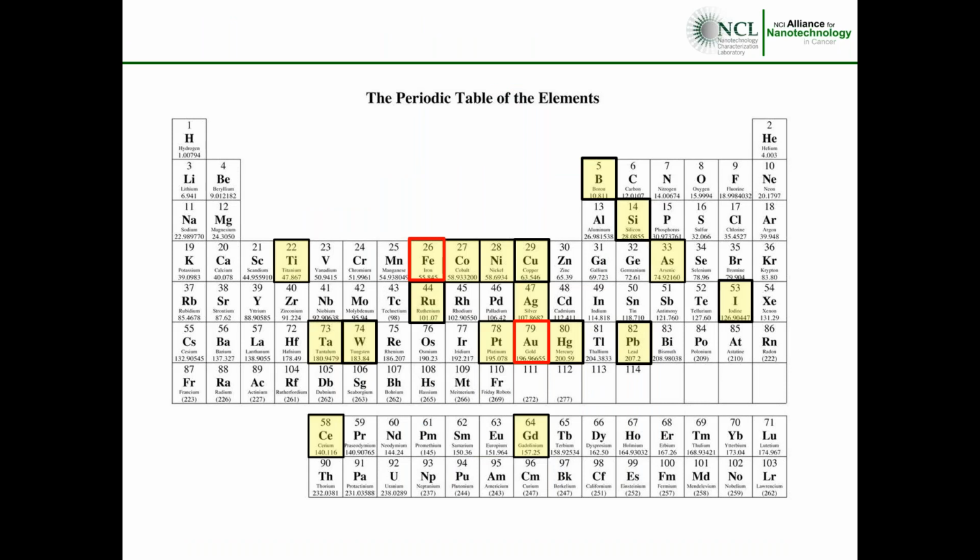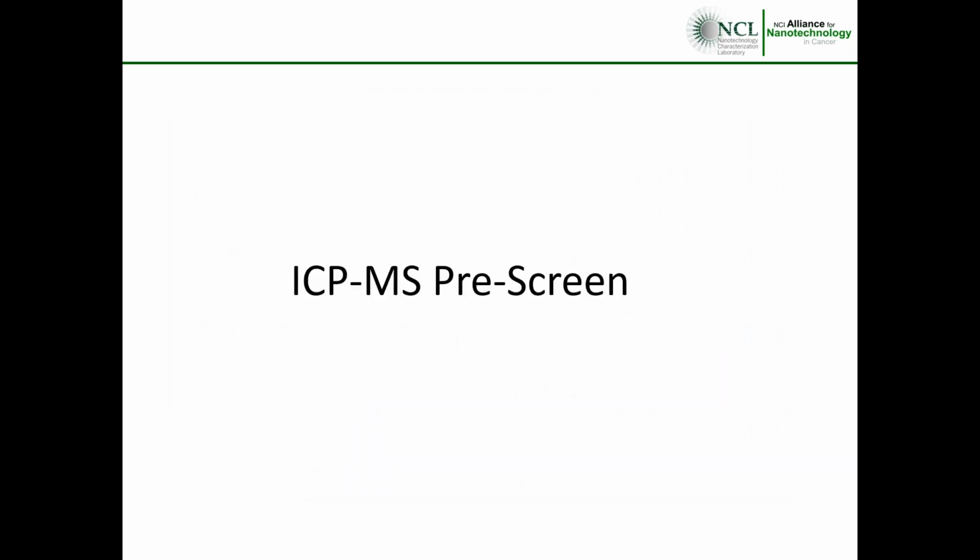And so just finally here, these are just some of all the elements that we've actually looked at that have been part of some nanocancer therapeutics, and it's quite a bit and ranges over many different properties. I further highlighted some of them in red, that's iron and gold, and these have by far been the 2 most abundant metallic elements that we've actually gotten as far as application-wise. So moving on.